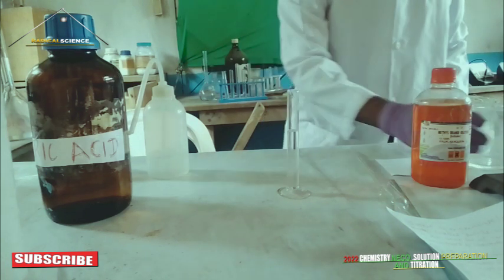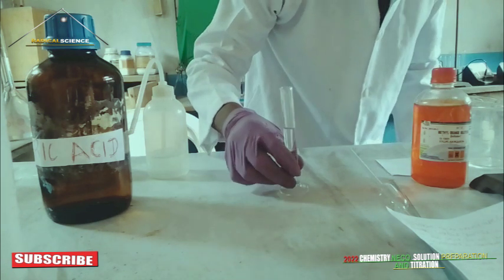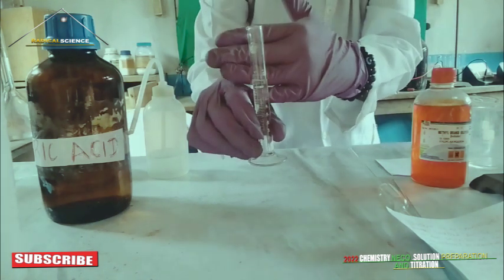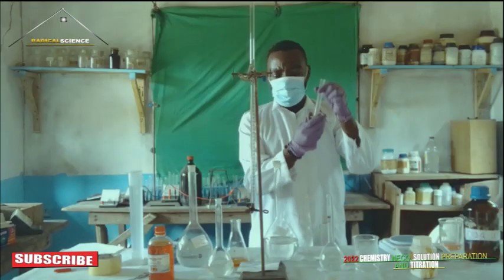Okay, so we have our 9.5. Look at it very well. You can see we have our 9.5.